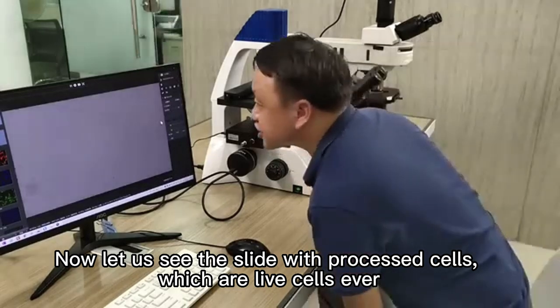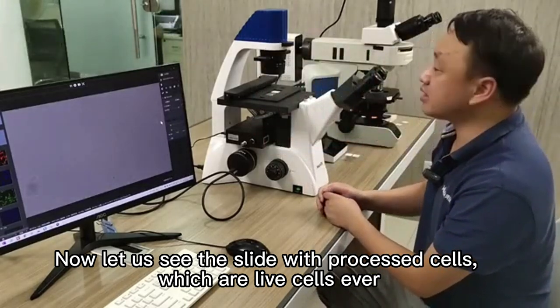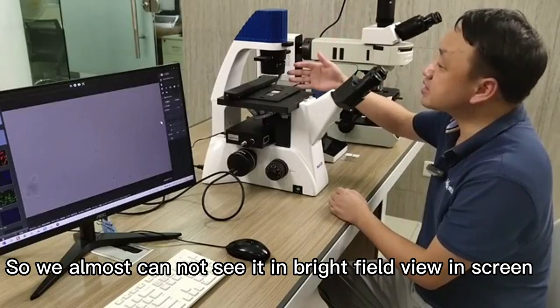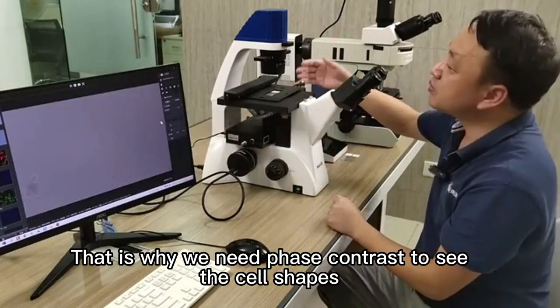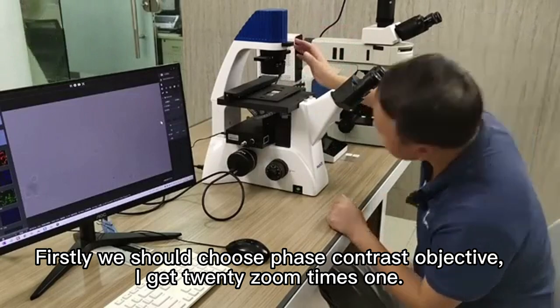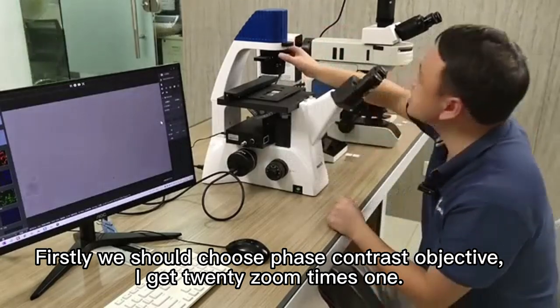Now let us see the slide with processed cells, which were live cells. The cells are somewhat transparent with no visible staining, so we almost cannot see them in bright field view on screen. That is why we need phase contrast to see the cell shapes. Firstly, we should choose a phase contrast objective.